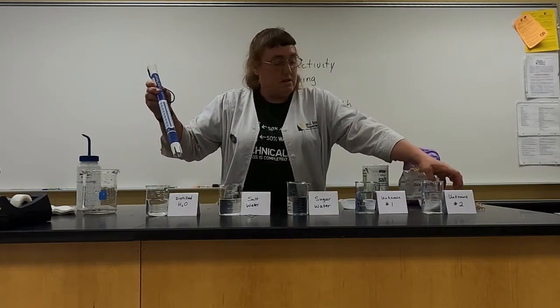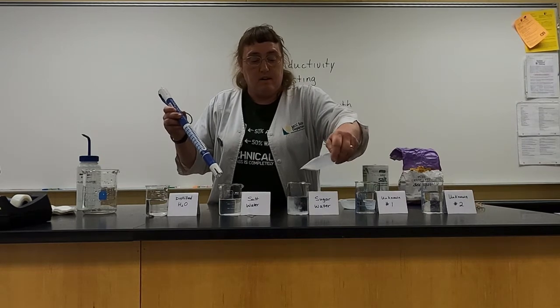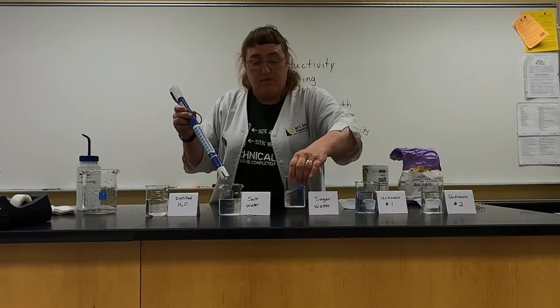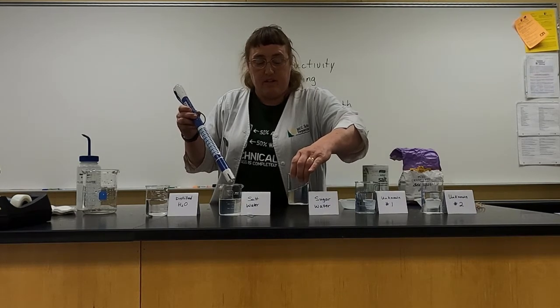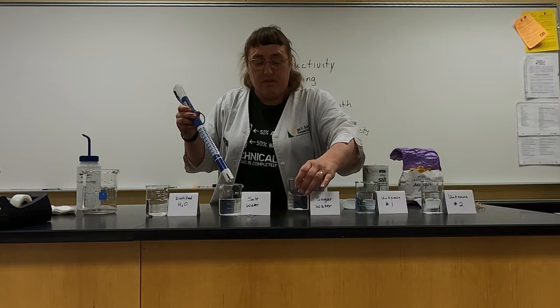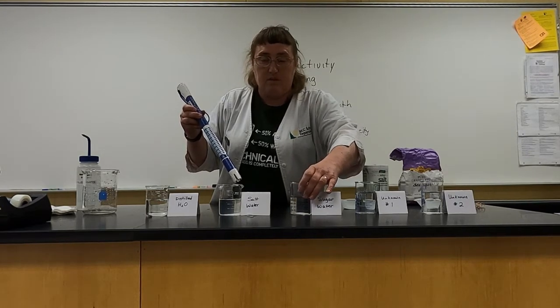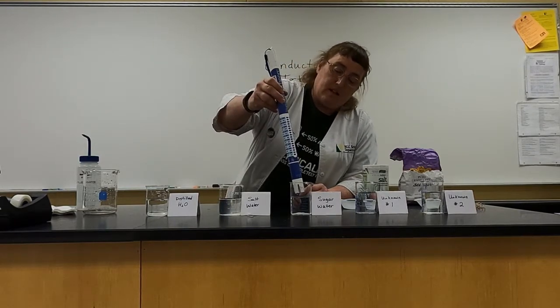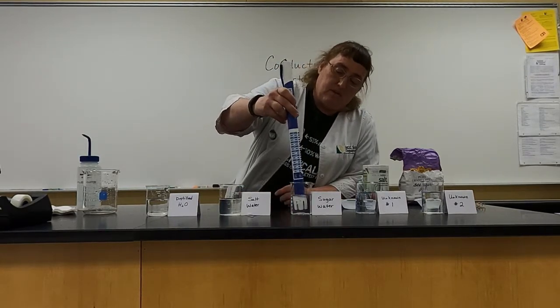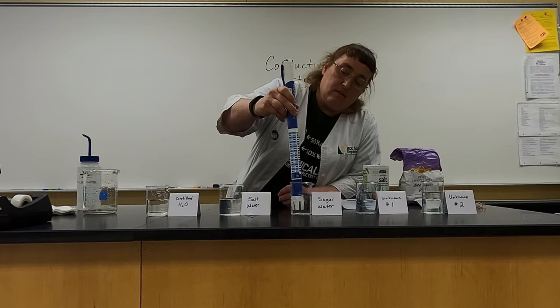Now in this third beaker we're going to add a little bit of sugar. Sugar, or glucose — hopefully you remember from your lecture that glucose is a covalently bonded molecule. Even though it will dissolve in the water, the sugar molecules themselves don't actually come apart like the salt does. So when you put this in, you get pretty much no conductivity.